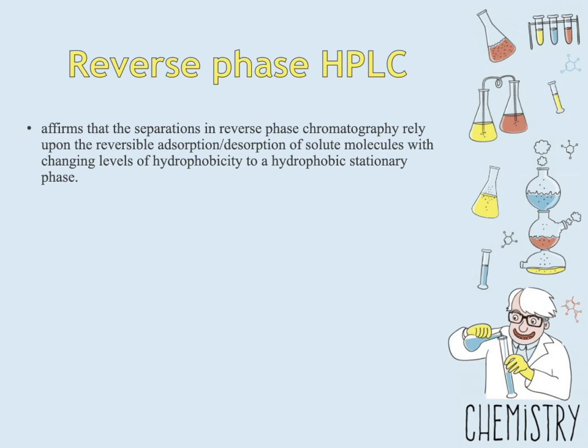Overall, HPLC is a sophisticated chromatography technique that gives faster and cleaner purifications than other types of chromatography. But the problem is that it cannot provide you with the credibility that your results are really credible.